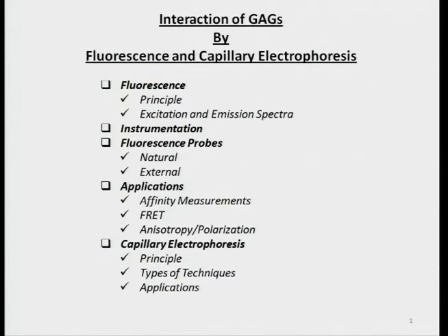I don't think we really talked a lot about fluorescence, so we thought it would be a good idea to talk about fluorescence. And obviously we never did talk about electrophoresis, especially capillary electrophoresis, that we are going to use. And we have both experiments planned, fluorescence and electrophoresis. Both are very simple experiments, so this is not really complicated.